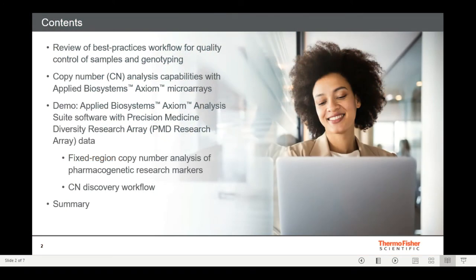In this webinar, we'll start by reviewing the best practices workflow for sample QC and genotyping before we go through some of the copy number capabilities for Axiom microarrays. Then I'll show a tutorial or demo of working with Axiom data for copy number. We'll be looking at data from the Precision Medicine Diversity Research Array. And at the end, I'll provide a summary and some contact information.